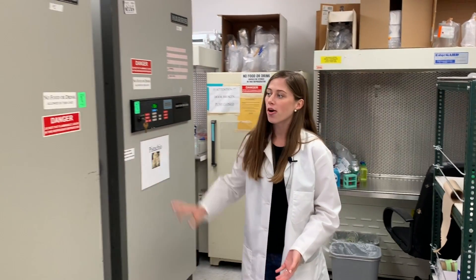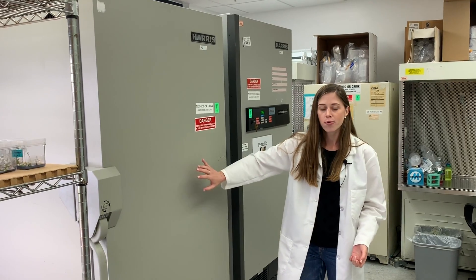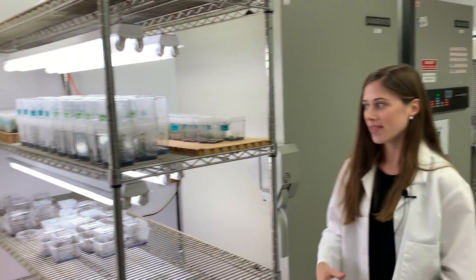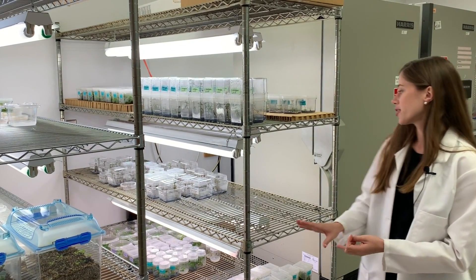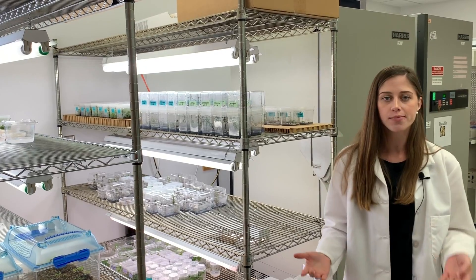Here are two of our really large negative 80 degrees Celsius freezers, which we use for more long-term storage of DNA or different tissue samples. Over here are our growth racks, where we grow everything from blueberries to basil to hops and different succulents, even Venus flytraps and coleus.